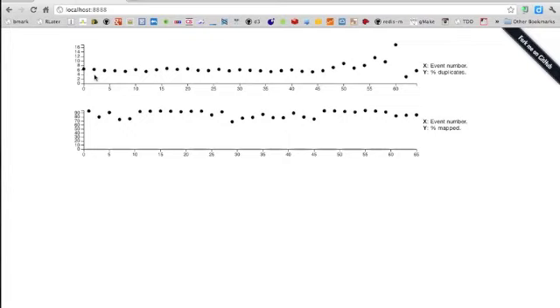So the front end is this web app that I'm showing you here, and what it does when you load the app, it's basically pull all the data that we have, all the metrics available for the BAMs that we have in the system, and it shows these dot plots displaying a couple of metrics: the percentage of mapped reads and the percentage of duplicates. You can see how, as we move through the different dots, we see to what project and subproject this BAM belongs to. And this is the main part of the front end.